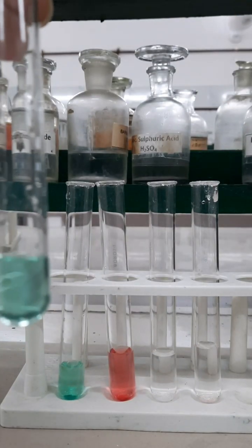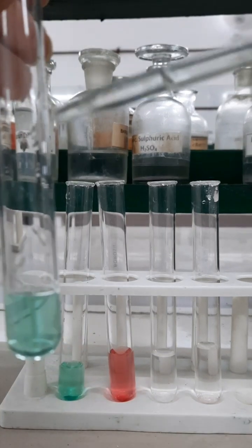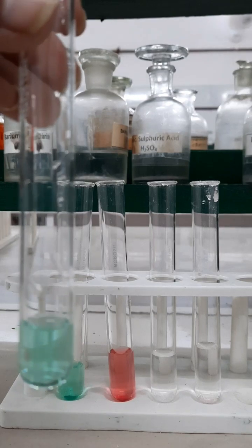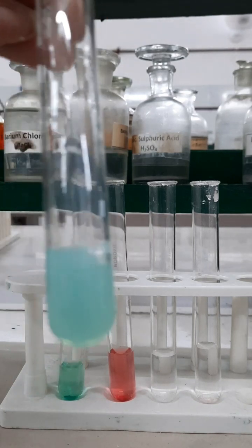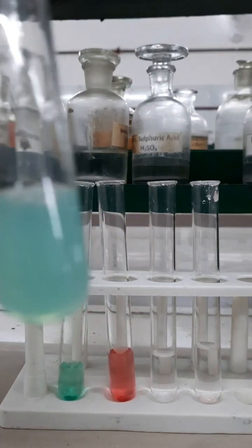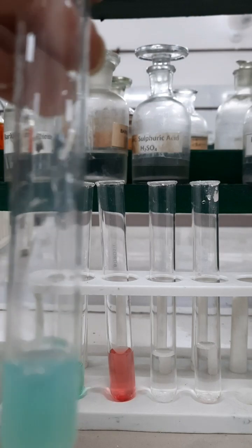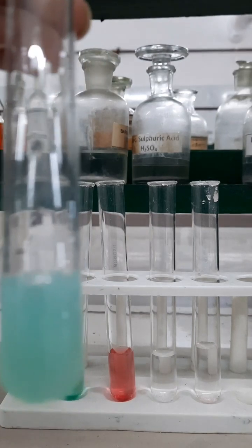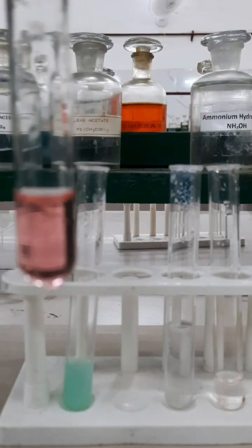After adding sodium hydroxide solution, a green colored voluminous gel-like precipitate of nickel hydroxide will be obtained and it will not dissolve in excess of sodium hydroxide.